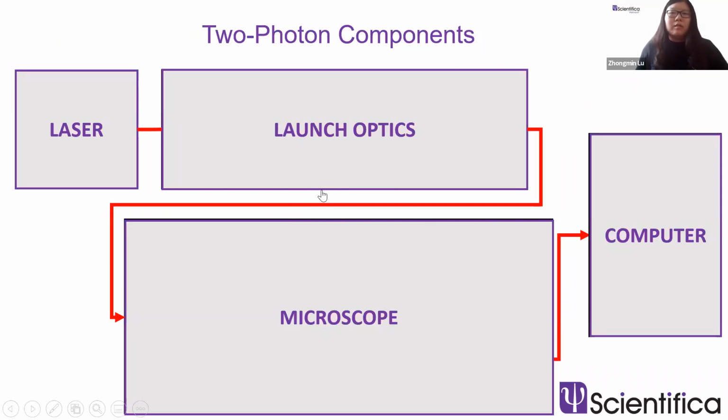Hopefully, before that, let me wrap up a little bit. I talked about the most commonly used technology, fluorescence multiphoton microscopy. Then I talked about label-free multiphoton microscopy, some flavors of multicolor imaging, and another really important application, 2P FLIM. Here, I just want to give you a little tour of what a 2P system is usually composed of. Current 2-photon systems are composed of four major parts.